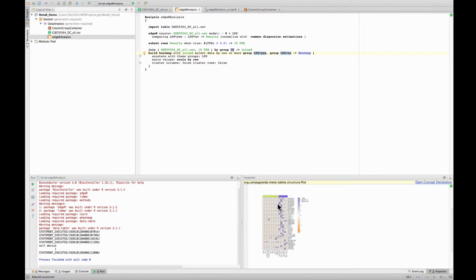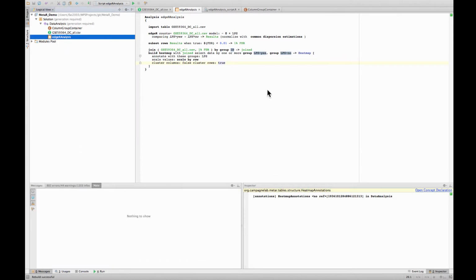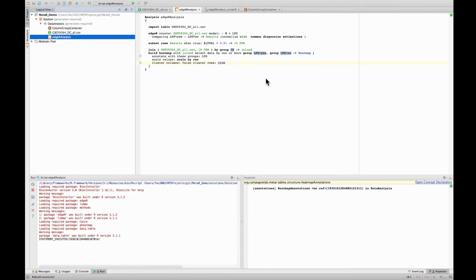those groups. Another thing that we could do to make it easier to see is to cluster by gene. So we can change this attribute to cluster by row, and this should put genes that have similar expression together, closer together in the heatmap.